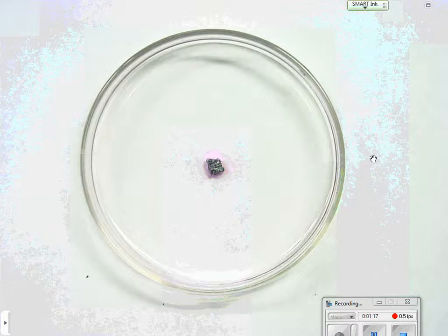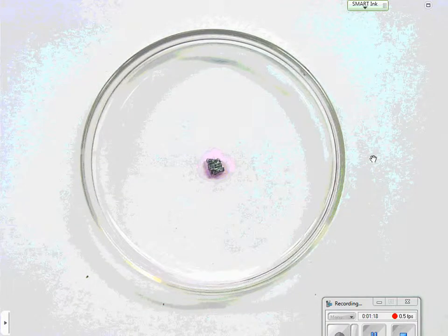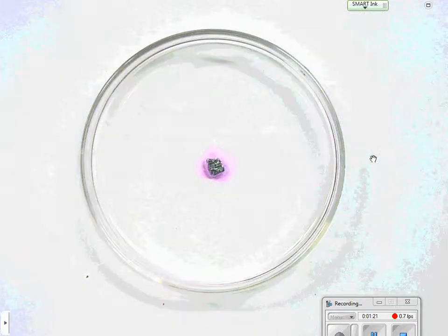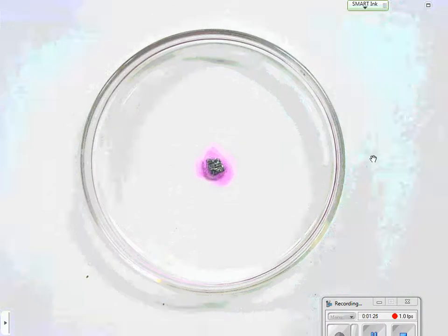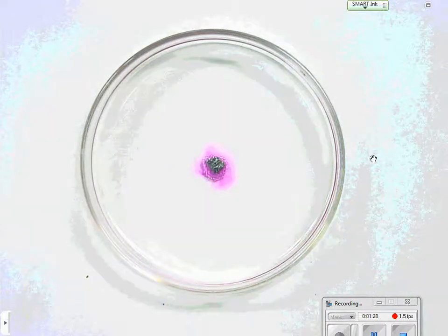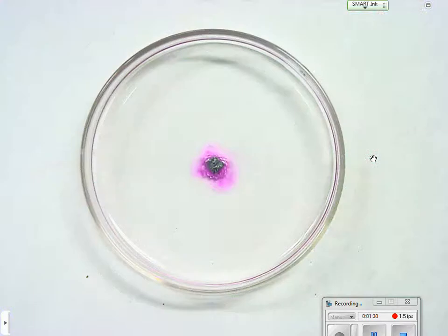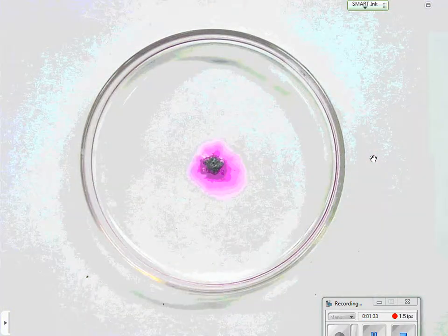Do you see anything happening? Now, everywhere where you see the purple is where there are hydroxide ions. And as the purple spreads, the hydroxide ions are being tracked.